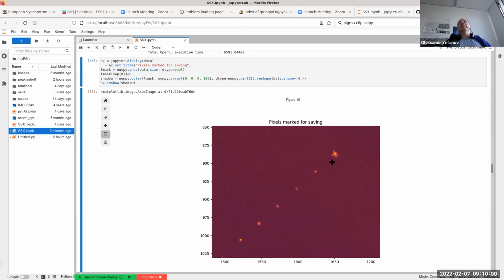You at least explained to me the solution you have chosen. For now, the solution has been implemented. It has been tested to work. We are at the very beginning of the commissioning of the detector on the beamline. It has been installed just a week or two ago. Actually, by the way, talking about this, you're talking about the Jungfrau detector, right? Yeah, I'll introduce it just a bit later on.